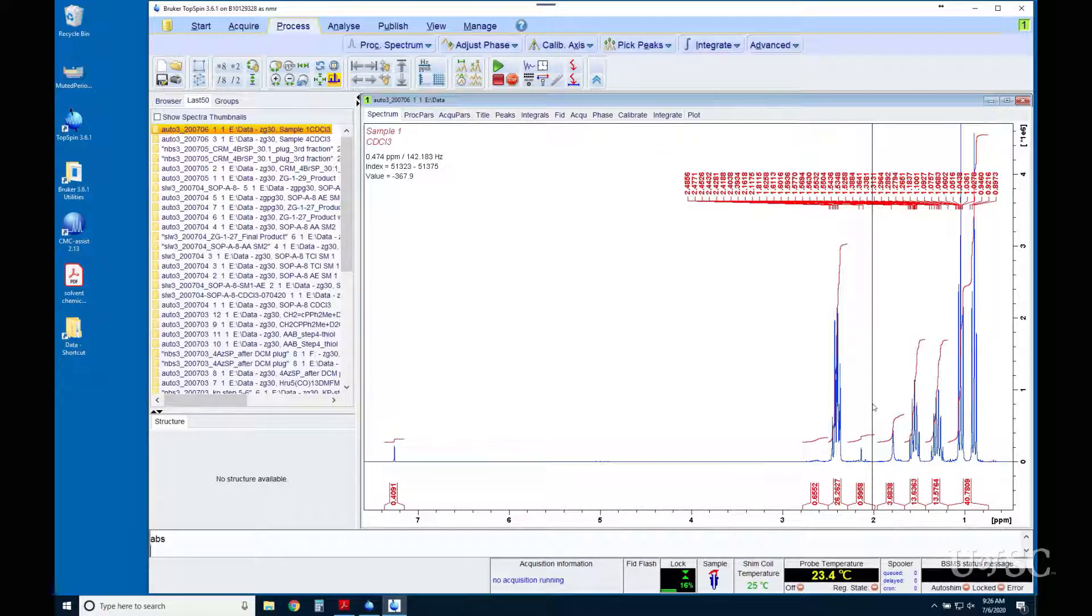The default parameters that ABS uses are pretty conservative with how far apart peaks are before it breaks them into two regions, how long the integrals are extended, and how large a peak needs to be before it is included. We are not going to go into how to adjust these parameters since it is easier to just manually define and edit integral regions.